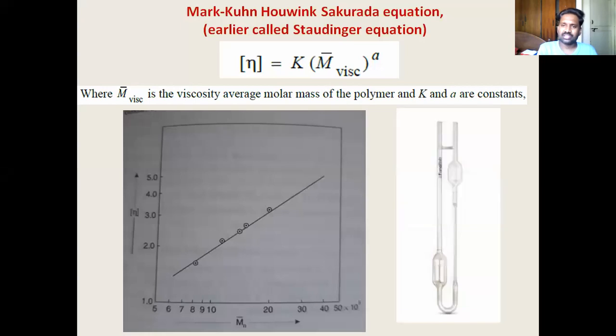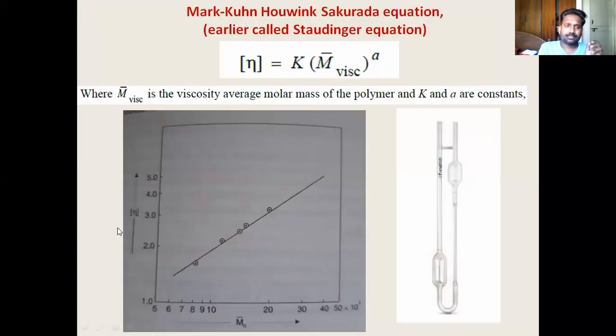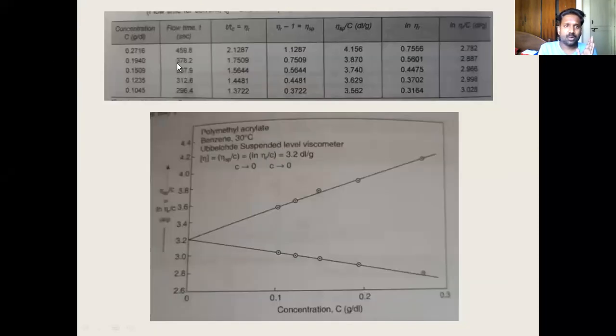And this was, of course, the experimental apparatus I was talking of. Fine. But as I told you, the variable here is intrinsic viscosity, but your experiment gives you viscosity of the solution, not intrinsic. So now, for example, you see this.